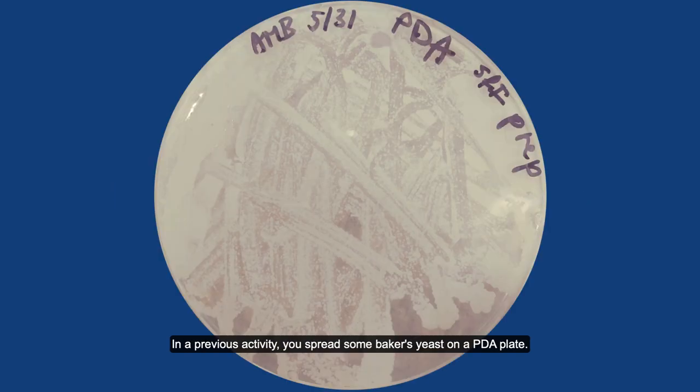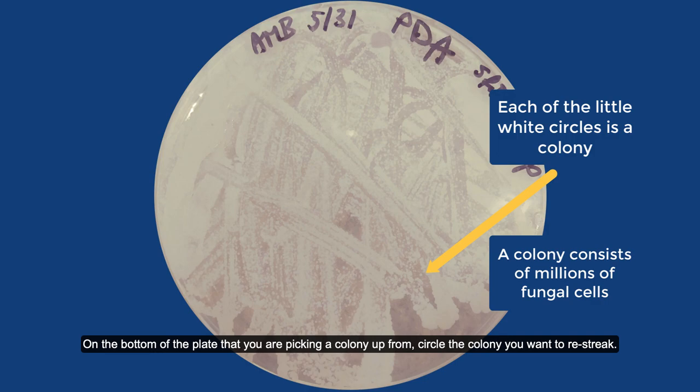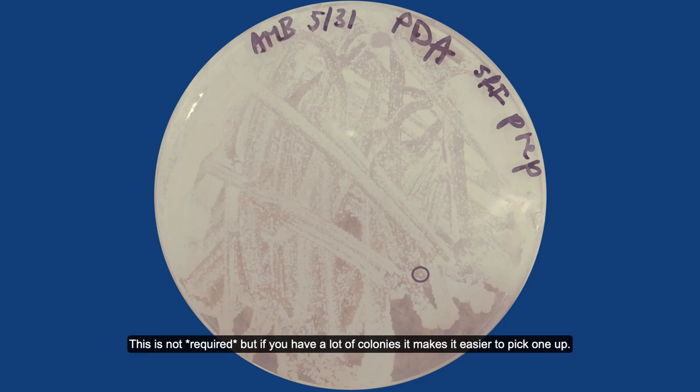In a previous activity, you spread some baker's yeast on a PDA plate. This single-celled fungus produces white colonies on the surface of PDA. On the bottom of the plate that you are picking a colony up from, circle the colony you want to re-streak. This is not required, but if you have a lot of colonies, it makes it easier to pick one up.